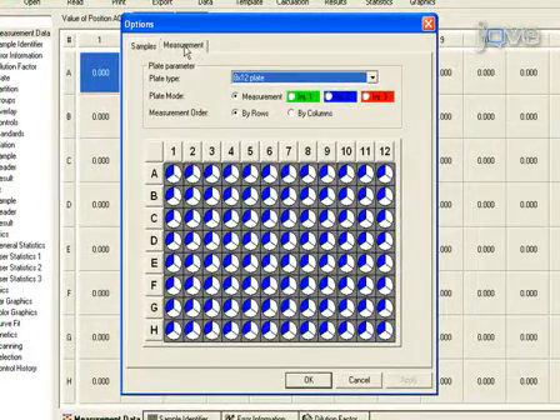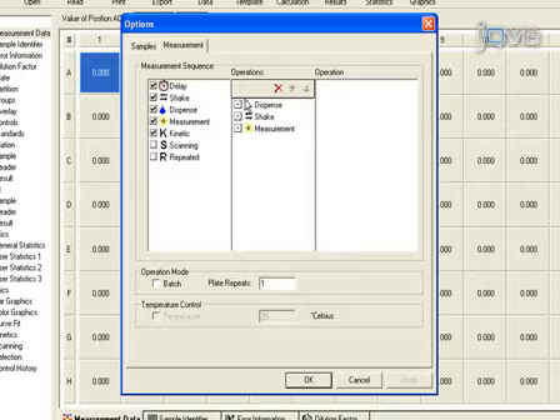For these measurements, 50 µL of coelenterazine substrate is injected, the plate is shaken for 2 seconds, followed by a 5-second read of luminescence.